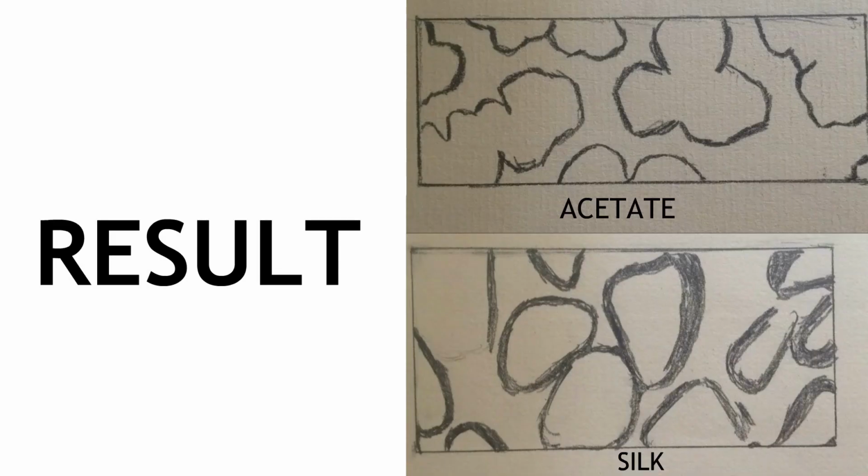The microscopy test shows that silk is made up of fine, smooth, round shapes with little variation in diameter, which is common for natural fibers. Meanwhile, acetate has bulbous or multilobal shapes which have large variations in diameter, indicating it is a synthetic fiber.